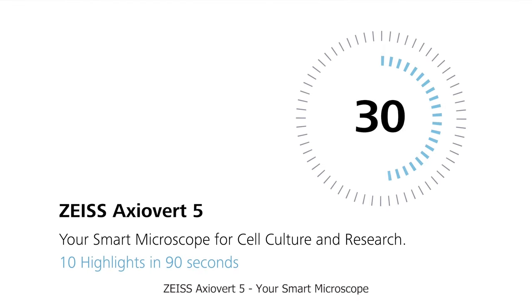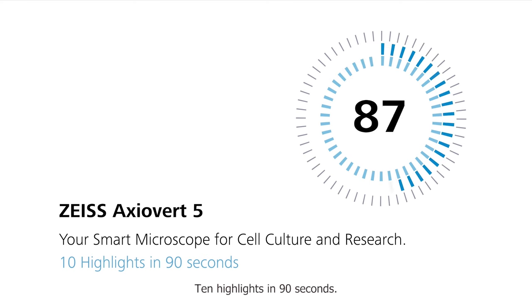Zeiss Axiovert 5, your smart microscope for cell culture and research. 10 highlights in 90 seconds.